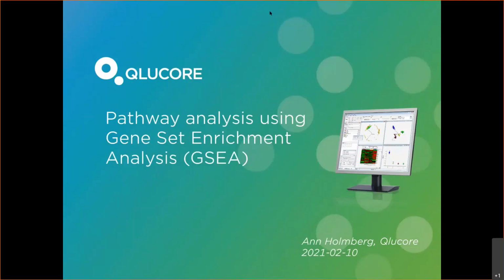My name is Ann Holmberg and I will talk to you for the next 30 minutes regarding Gene Set Enrichment Analysis. So let's start with that.